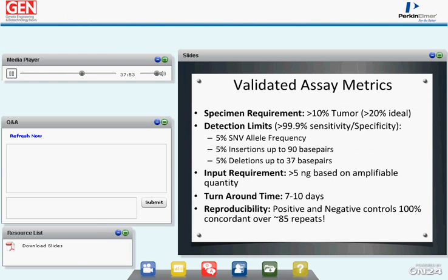For us, that meant having a minimum tumor percent of about 10%. So after Mike's talk there, the relationship between the number of tumor nuclei to non-tumor nuclei in a given specimen, 20% is ideal given the current miscalculations based upon the pathologist assessment. But with the advance of these tools, we'll be able to push these limits even lower since we're able to really have a solid estimate of that tumor percentage.